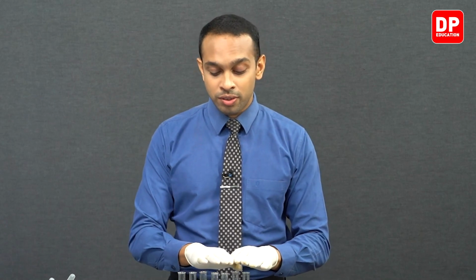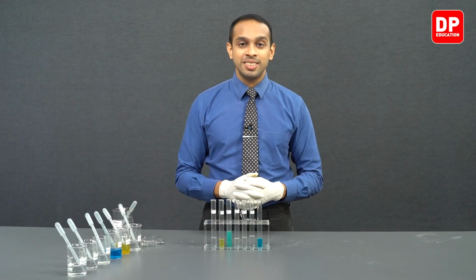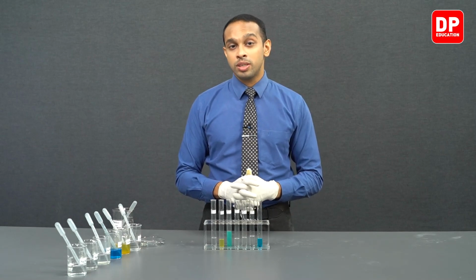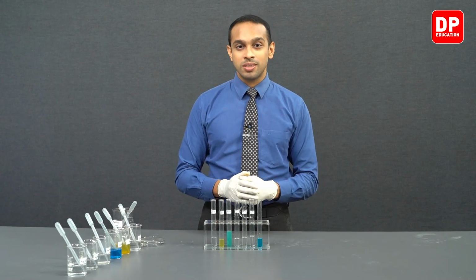However, lead is not more reactive than any of the ions that are present over here. So we can conclude lead is not more reactive than sodium, magnesium, zinc, or iron, but lead is more reactive than copper. So after making that observation, we can now move on to the third part of our experiment, where we observe how magnesium reacts with these solutions.